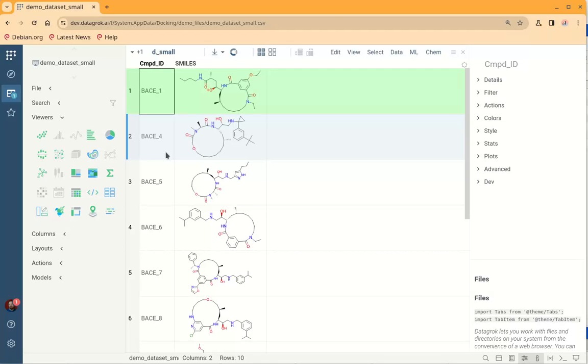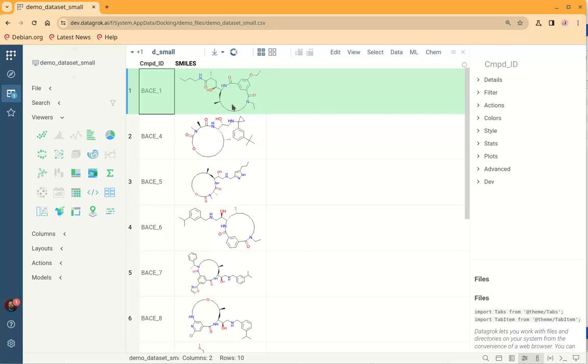Hello everyone! In this short video we will see how to perform docking with Datagrok Auto-Dock Plugin. Let's imagine that we have a table with chemical molecules that we need to dock to some macromolecule and estimate the binding affinity.